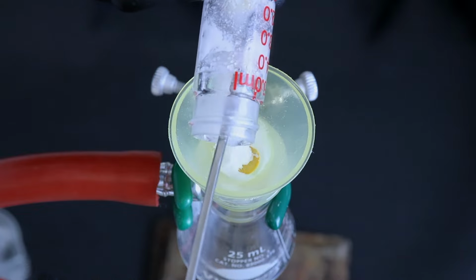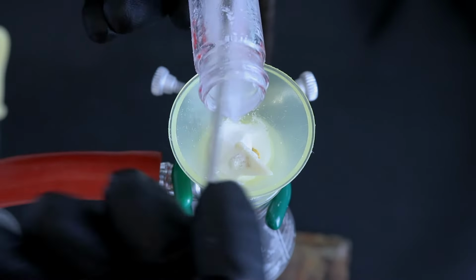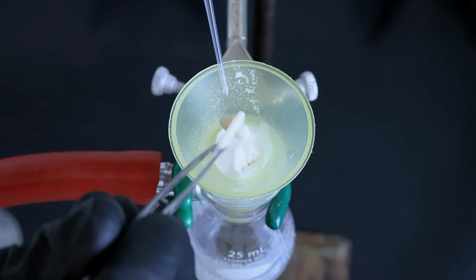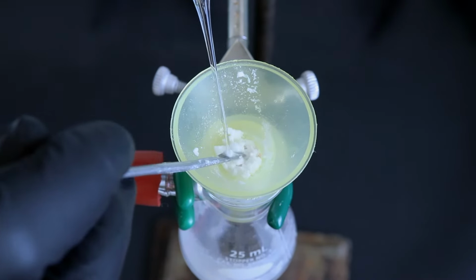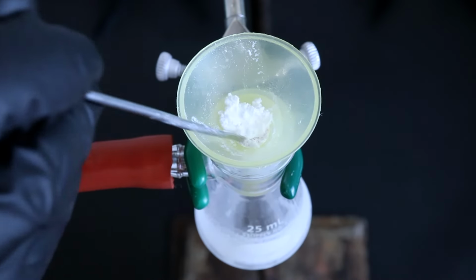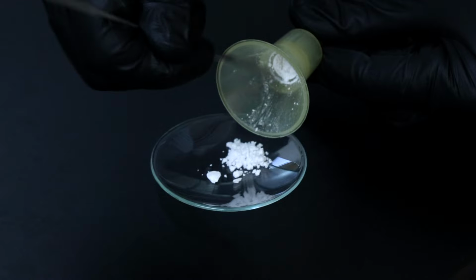So I'll remove that from the solution using vacuum filtration. And I'll rinse the conical vial with some cold ligroin, also rinsing the spin vane and the derivative on top of the funnel with ligroin as well. Once it's been allowed to dry for a few minutes, I'll go ahead and remove the derivative from the funnel and find out where its melting point is.